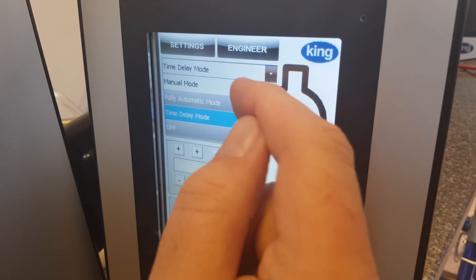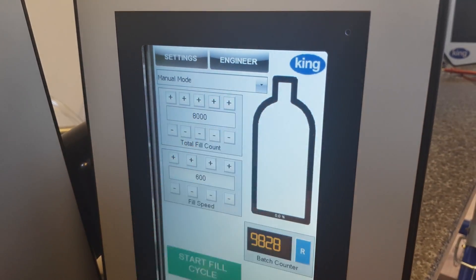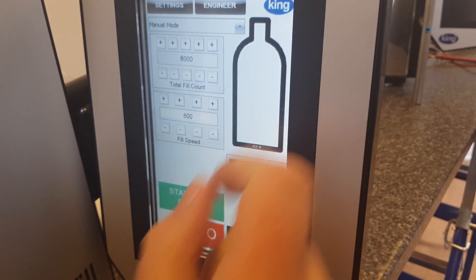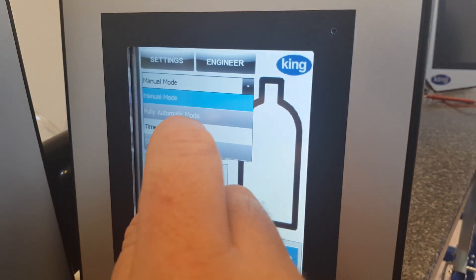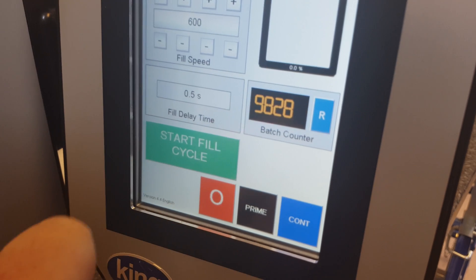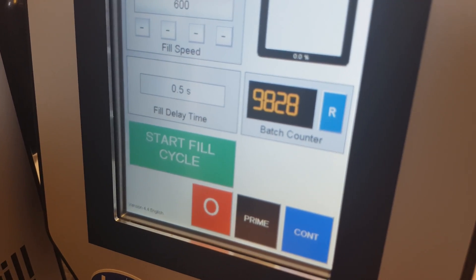There are two modes that you're interested in. In manual mode, when the button is pressed once, it will dispense one lot of liquid. Or time delay mode, where a time delay is set between each liquid being dispensed.